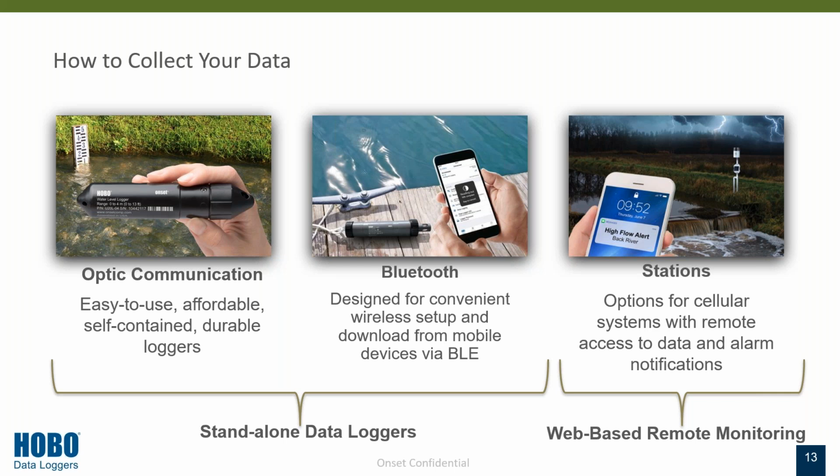Now, the waterproof shuttle is something useful when you have quite a few loggers. It may take some time to download that data and you're near a large body of water. You don't really want to bring your personal or your work laptop. So what you'll do is take the waterproof shuttle and the appropriate coupler and hook it up to your optical logger. You'll push a lever to offload the data and then redeploy the logger and move on to your next one. After you're done collecting all the data, you'll take that waterproof shuttle back to your laptop and then upload the data.